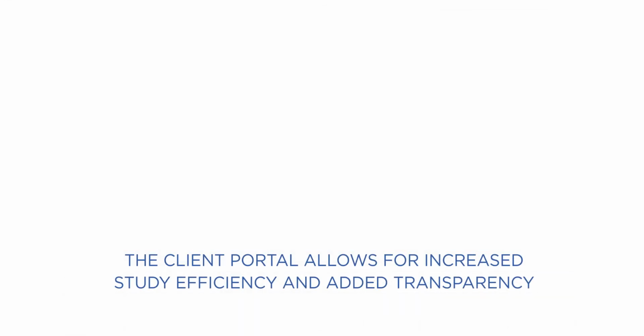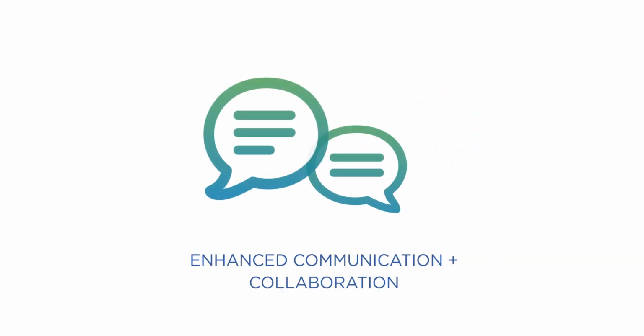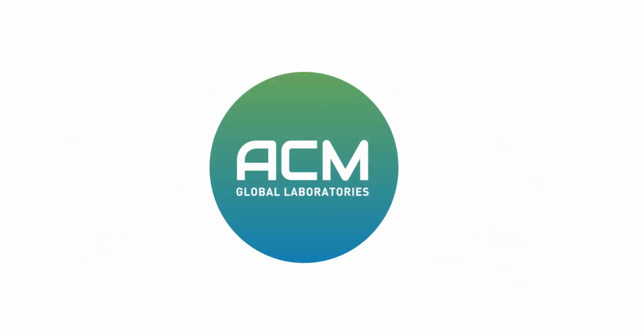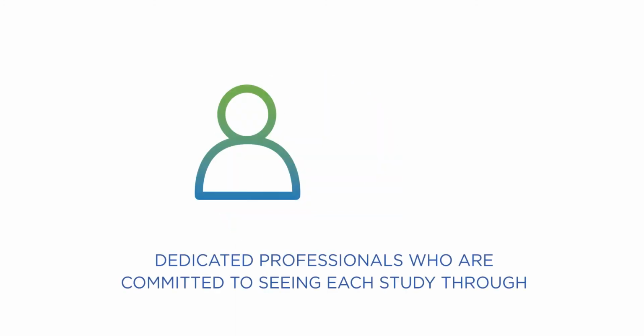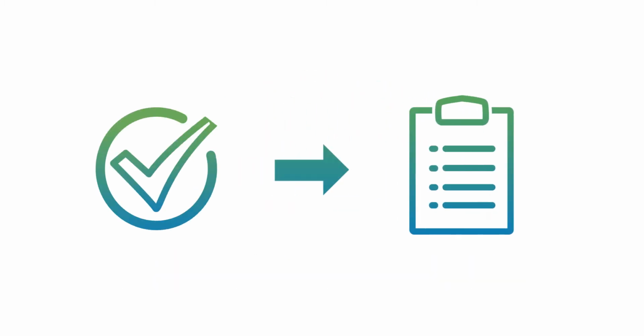The client portal allows for increased study efficiency and added transparency, in addition to serving as a tool for enhanced communication and collaboration across the study spectrum. When you partner with ACM, you're not only partnering with an organization that understands the importance of these elements, you're partnering with a group of dedicated professionals who are committed to seeing each study through with the care and attention they deserve.